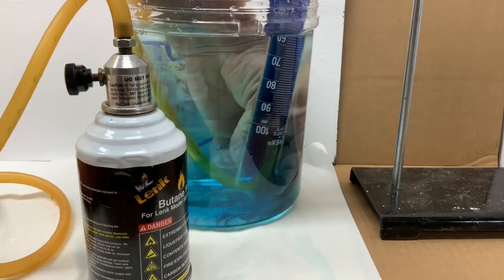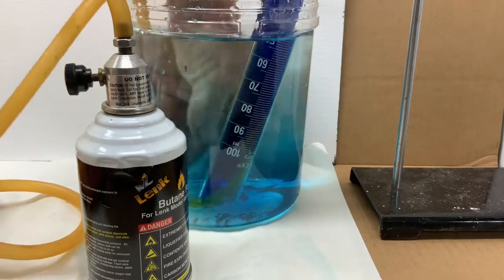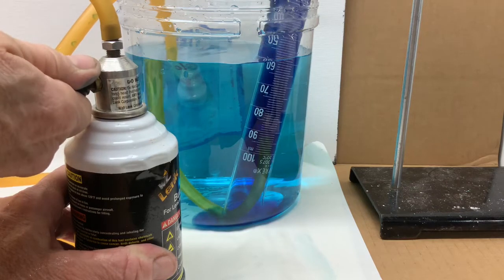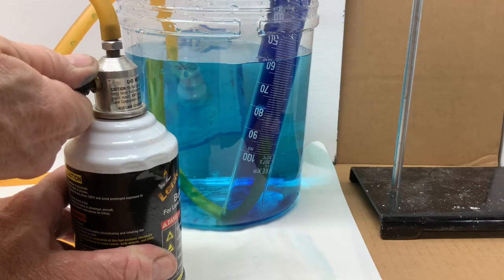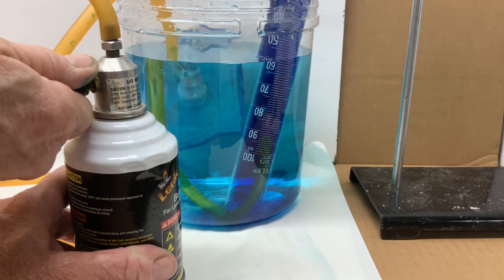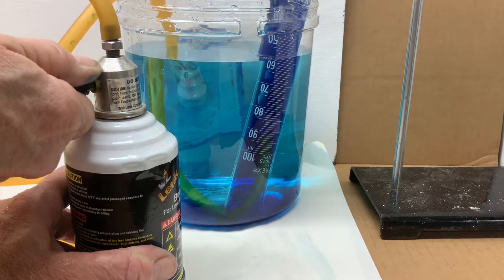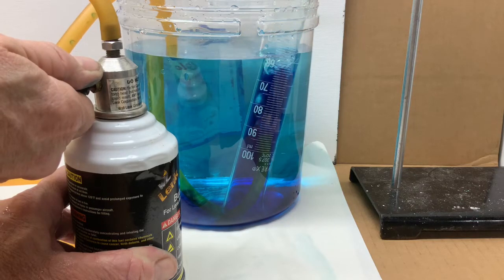I'll put the hose up underneath the bottom of the grad cylinder, the inverted grad cylinder, and start adding the butane gas. The water is pushed out the bottom of the cylinder as the gas displaces the water in the cylinder.